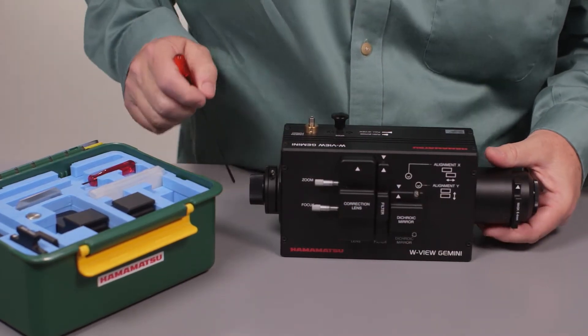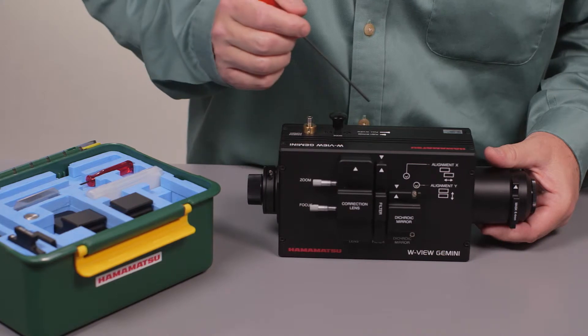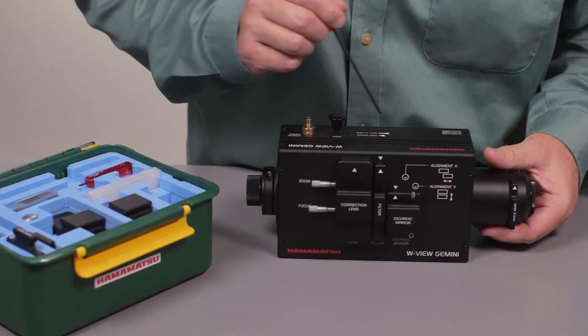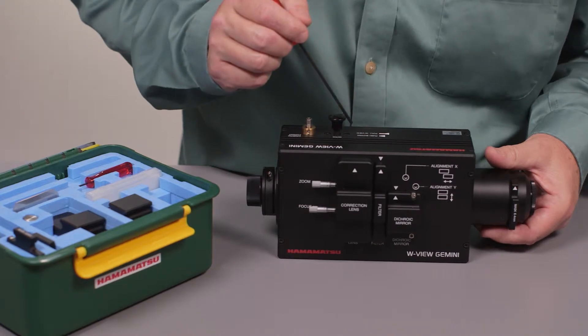But if you want to use this and it's optically not here — if you don't want to do any splitting — instead of removing this and compromising your alignment, you can use Bypass Mode.